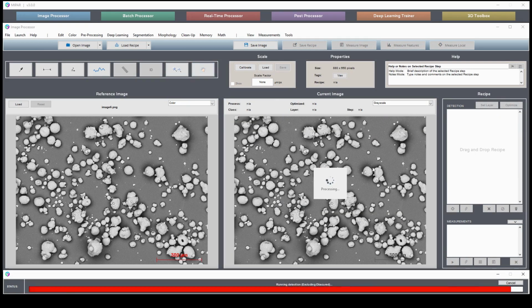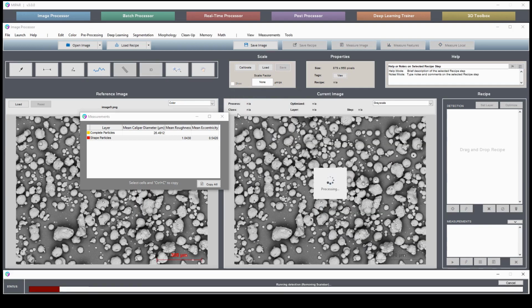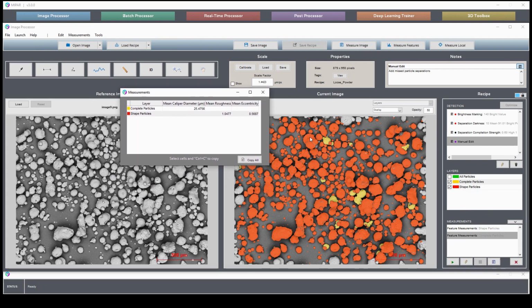Here is another image from the same powder lot, and we see its accurate detection. And here is an even more challenging case where there are many particles sitting on top of others. But the solution prevailed and accurately delineated features according to the project requirements. As you saw with the grains example, of course, these fields can be batch processed with all measurements generated at one time.